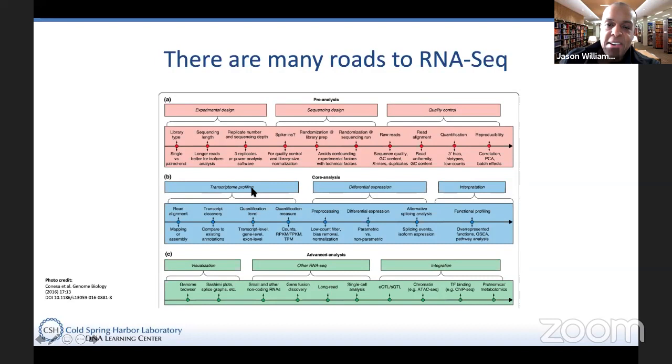There are different steps that you could choose to follow or not. There's just lots and lots of moving pieces. So it's way more sophisticated than the explanation I'm going to give you in the amount of time that we have here. But just to know that, don't worry about it.